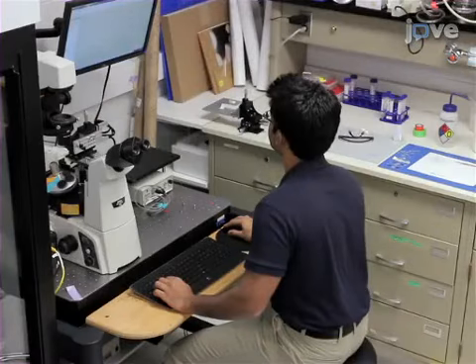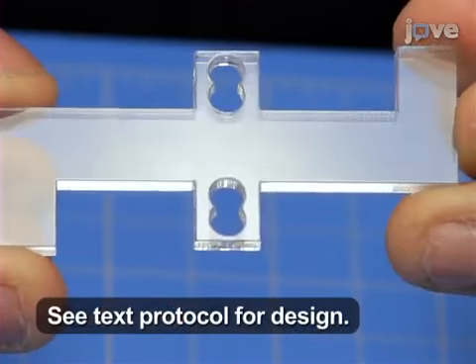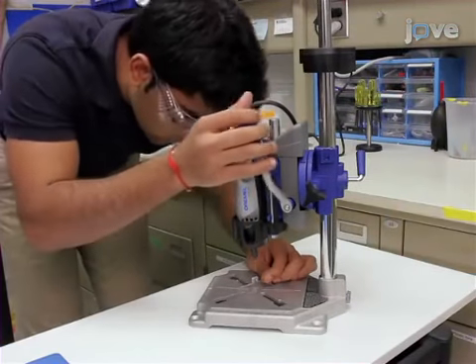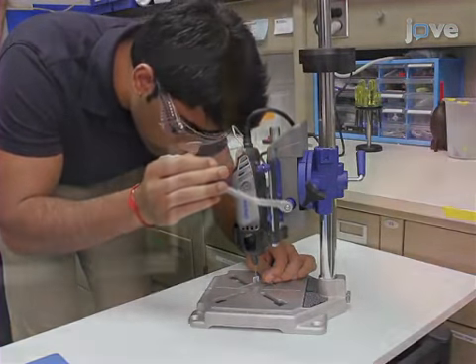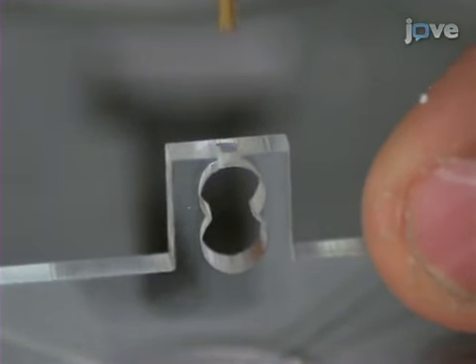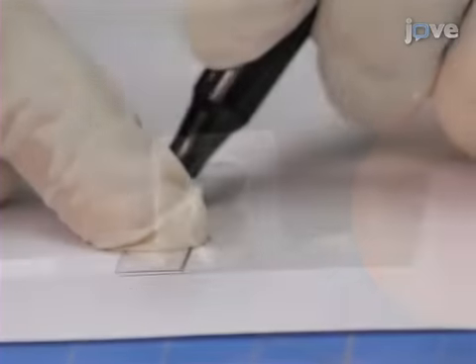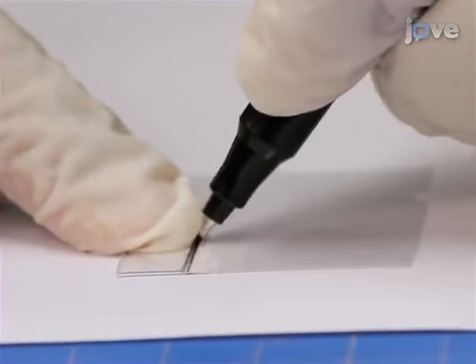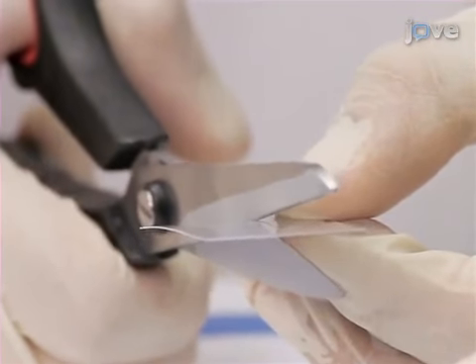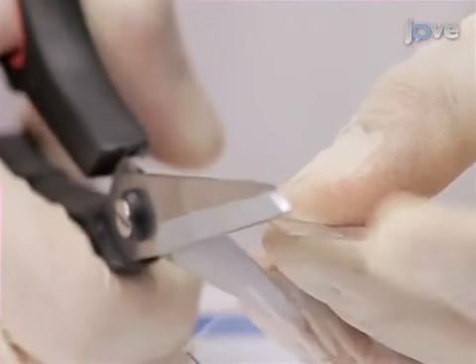Using CAD software, draw a shape for the chamber that can be made from acrylic using a laser cutter. First, drill 1/16 inch through holes on both sides of the assembled acrylic chamber that will drain to the infinity-shaped well. Second, cut a small rectangle with scissors from a 0.2 mm acrylic sheet to serve as the bottom of the infinity-shaped well.